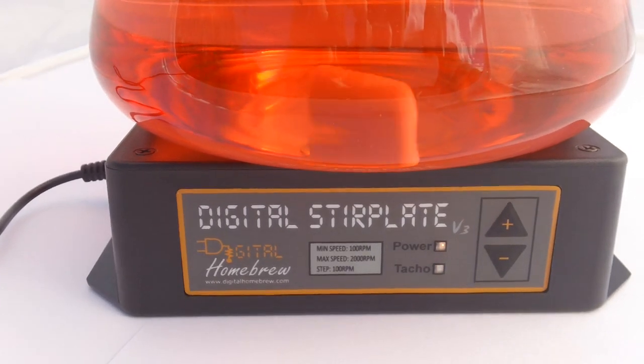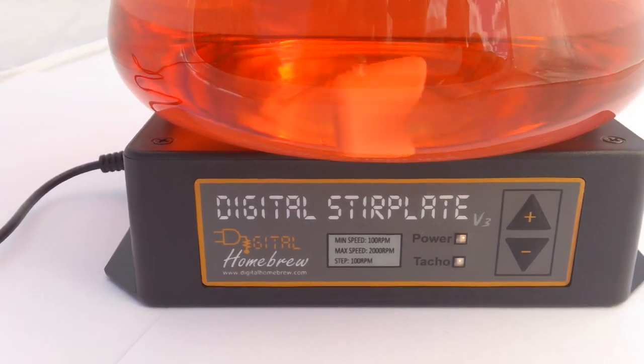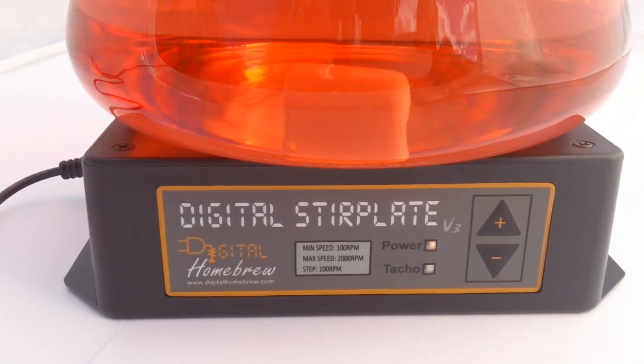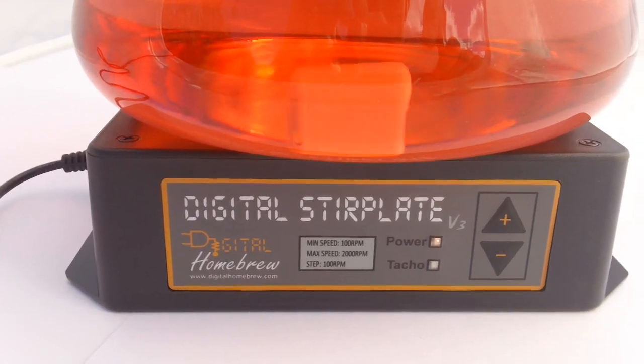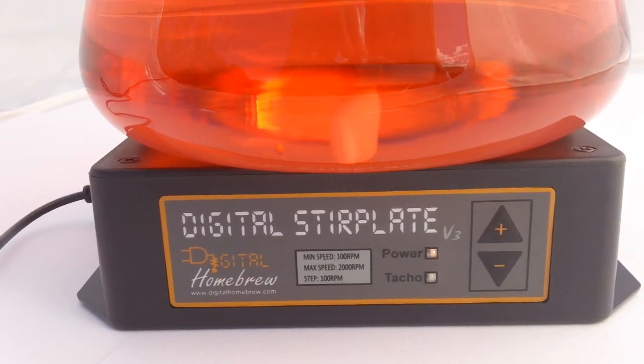That's 100 rpm increments and we go up to 2,000 rpm. It'll hold that speed day and night, and hopefully that gives you more consistency between making your starters, so you can remember what speed you set it at and next time just dial up the same speed. That's a slight advantage over the analog ones.